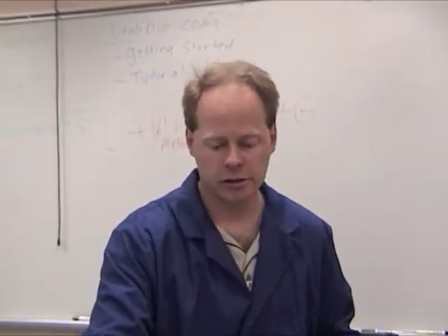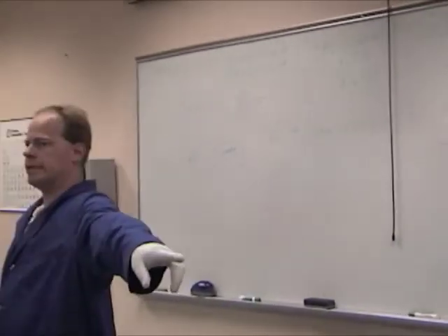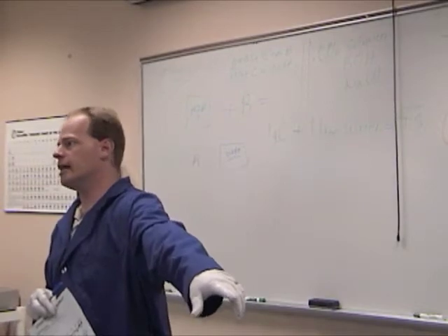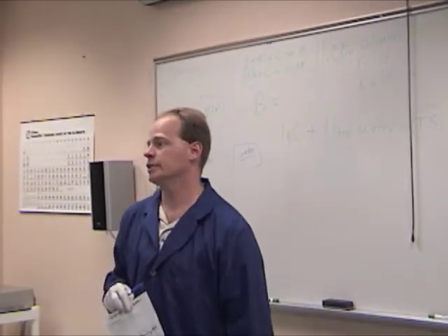I'm going to take this solution here and put it in this 1 liter jar. Whatever jar you get, you need to label that as poisonous. Our titration kits come with it labeled on the front. This looks an awful lot like water. If you've got kids or other people around, and it's a hot day, I'm thirsty, and they take a chug of that, that could be a bad situation really quick.